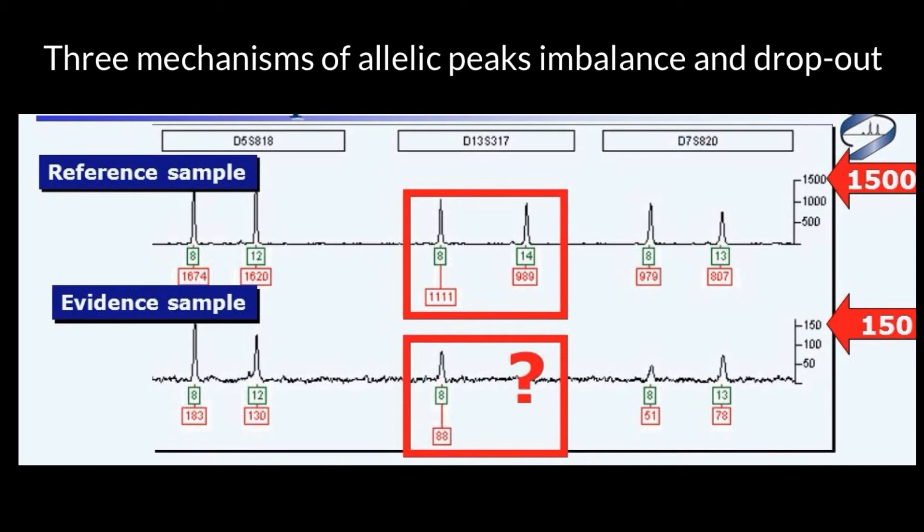But now we have to think whether we just have allele drop out here or this is a person who is homozygous at this locus. So this is going to be electropherograms of two different people.